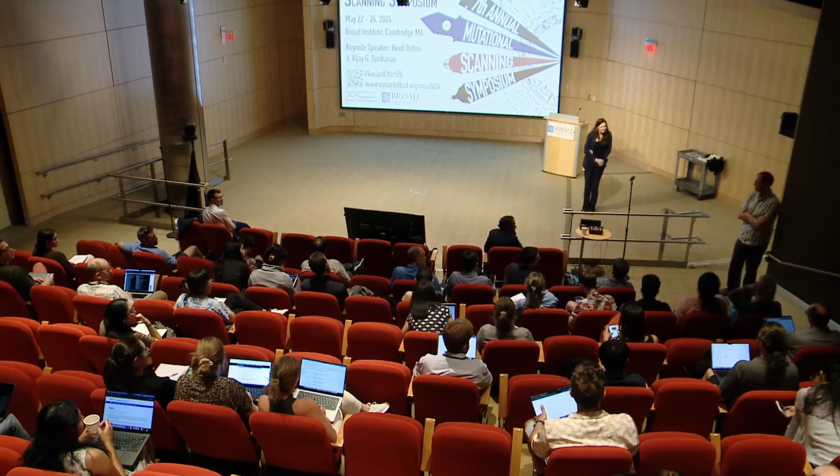Phenomenal talk, thank you. Anna Gloin from Stanford. I'm fascinated by the decision for the cell type that you operate in. I wondered if you had evaluated different cell types, what the spectrum of effects is, and why you landed on, I think it was an osteosarcoma cell line, as your go-to cell?